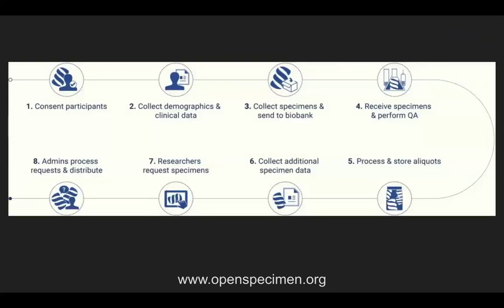Talking about a typical workflow, this is what we call specimen collection to utilization, tracking specimens from collection to utilization. That is, we start with steps like steps 1, 2, etc. Some of these could be done in other systems too.